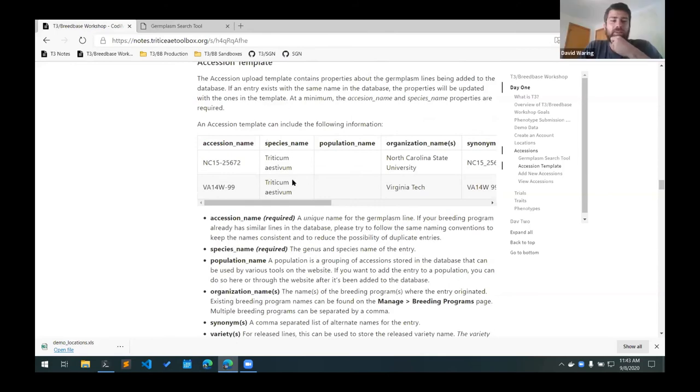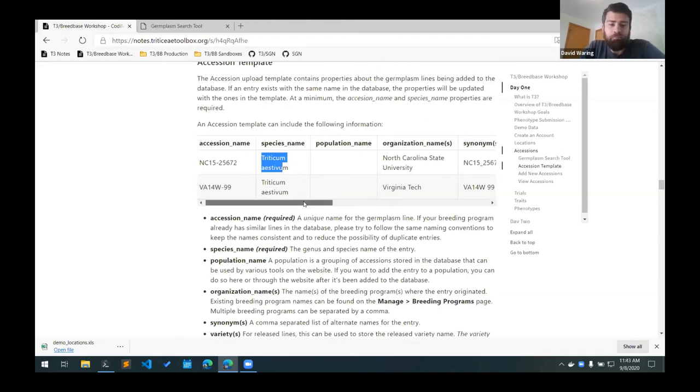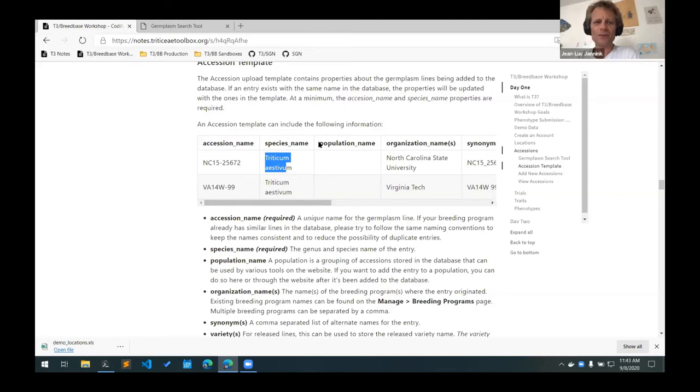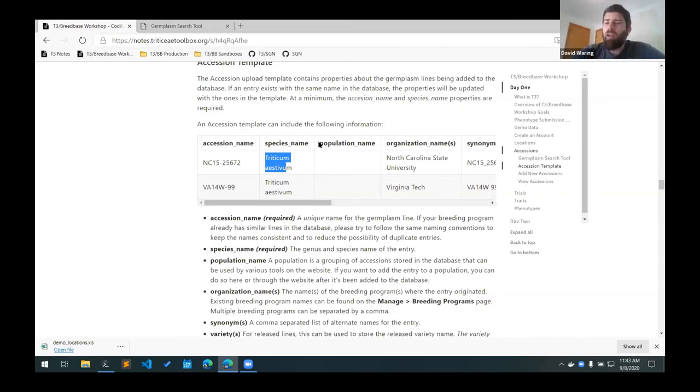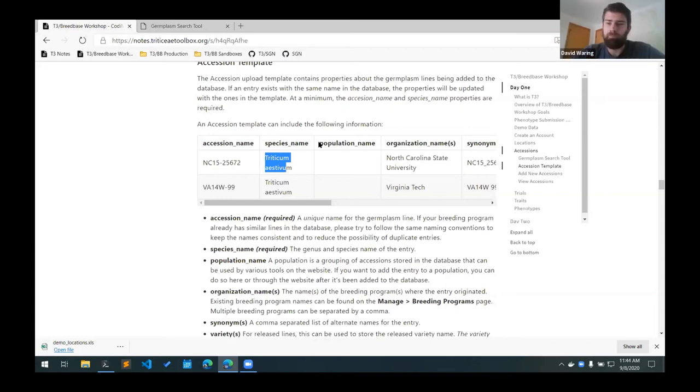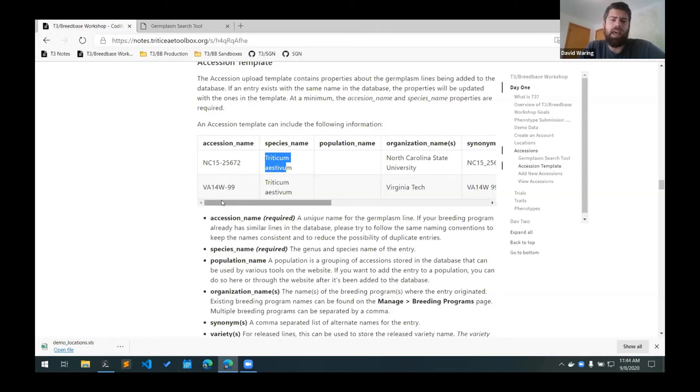The species name is the genus and species name for the line. So in this case we have Triticum aestivum and also have durum lines. Dave, are those the two species that are on T3 Wheat at the moment, Triticum aestivum and Triticum durum, or do you know if there are others? There are others as well. I think Breed Base already came with a whole list of different species. So I think there are other Triticum species in there as well. So if you're interested in different species, we can get you a list of what's in the database and then we can add new ones if you need to.